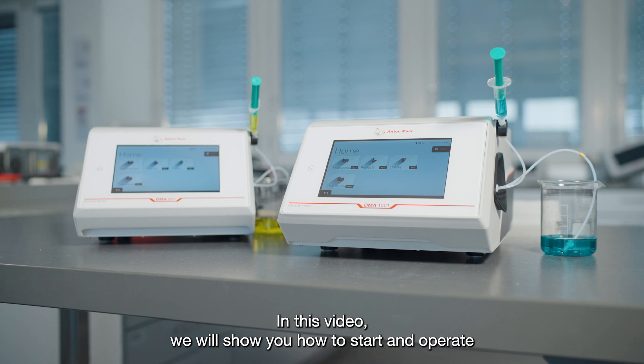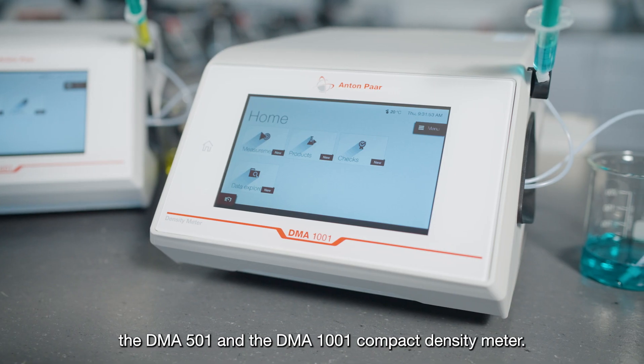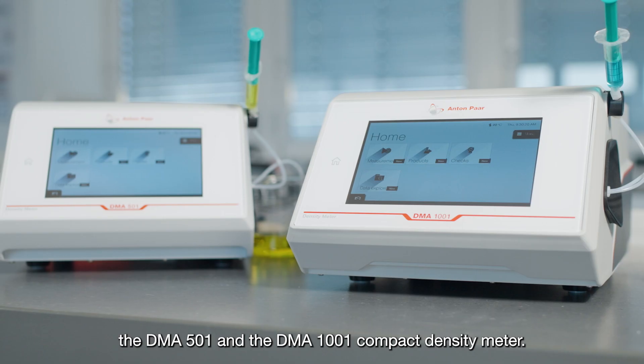In this video, we will show you how to start and operate the DMA501 and the DMA1001 Compact Density Meter.